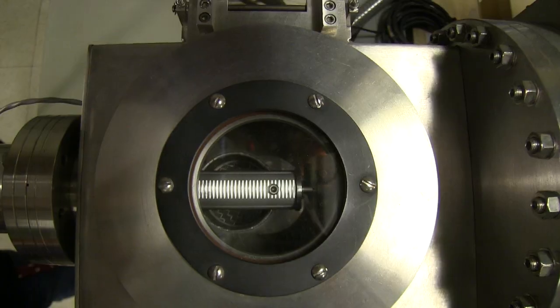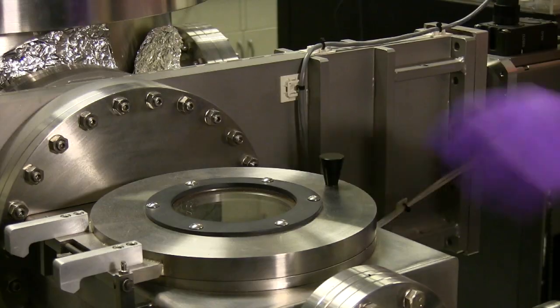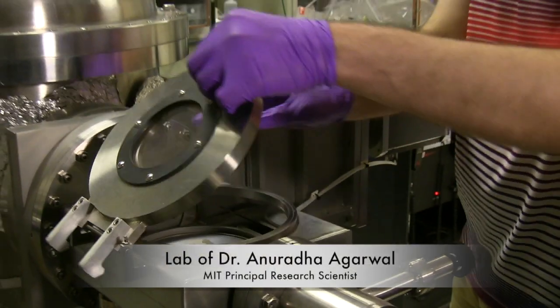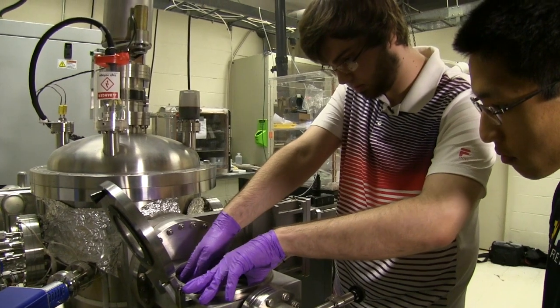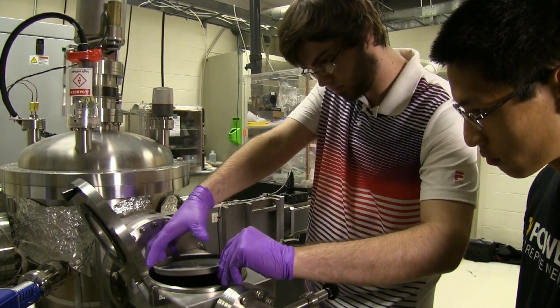Currently the main process chamber has a sample in it, so we need to open up the valve connecting the load lock to the process chamber, equalizing the pressure. After we pull the sample out of the process chamber and into the load lock, we can then close the valve and vent the load lock so that we can take out the sample.